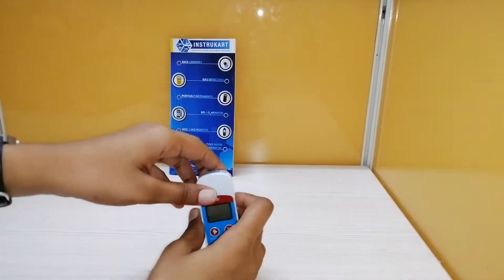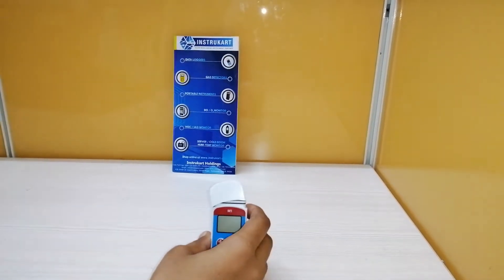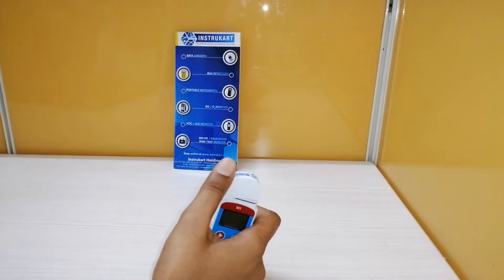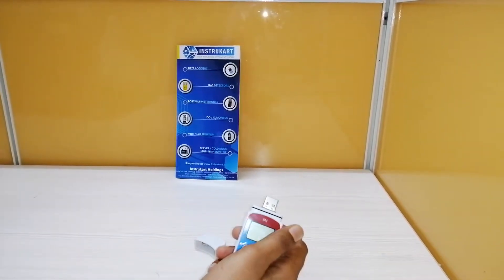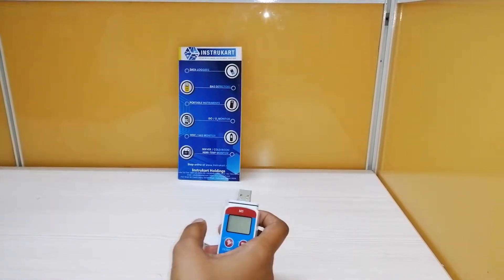It also has an integrated USB port for direct PC connection. Additional features include multi-level thresholds and a multi-functional LCD display. The data logger also has MKT calculation, which is mean kinetic temperature calculation.